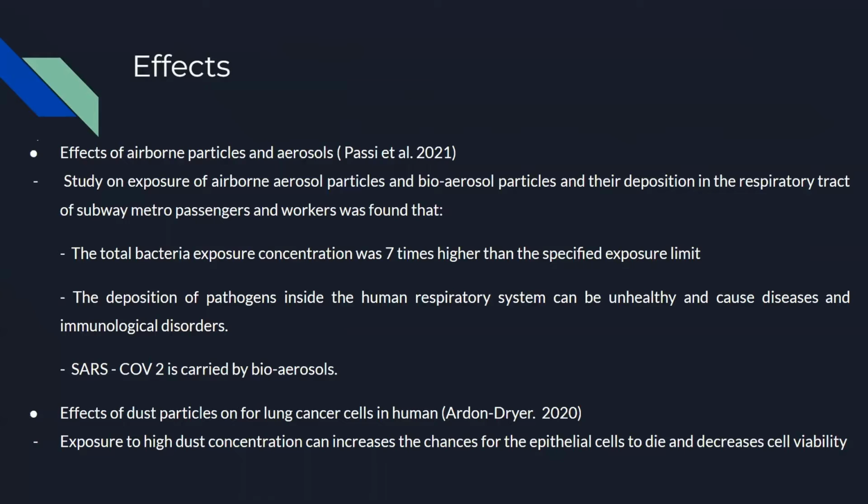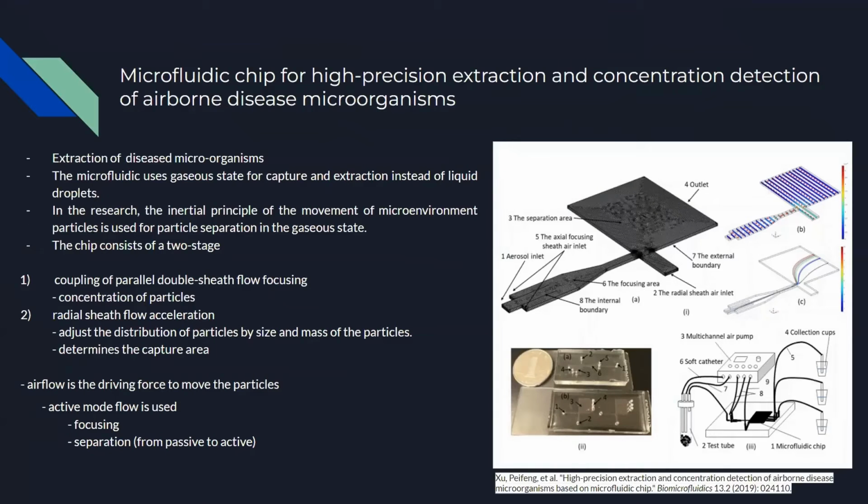and decrease cell viability. This microfluidic chip is extracting microorganisms directly from the gas stream, and unlike most microfluidic chips that use liquid droplets, this chip uses the gaseous state for capture and extraction and uses the inertial principle of the movement of microenvironment particles for separation.